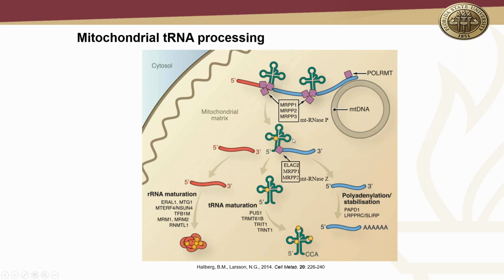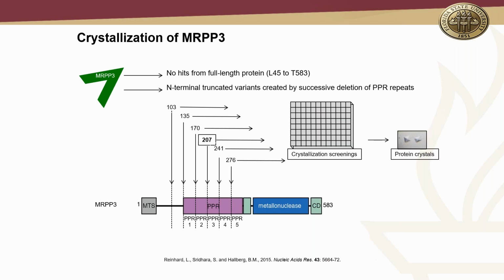But I would just like to highlight one of the sub-projects that I was basically involved in, wherein we were trying to understand the crystal structure of MRPP3 protein, among many others. So we were trying to crystallize the full-length MRPP3 protein, but unfortunately we were not able to generate any crystals of the full-length MRPP3 protein. What we did was to generate a series of truncated variants of MRPP3 protein.